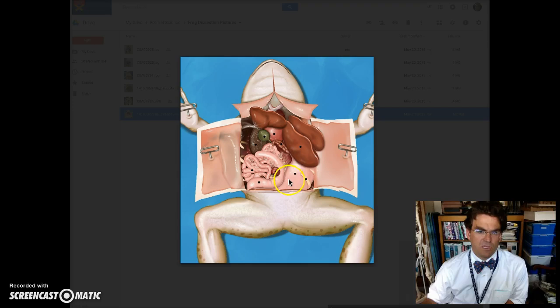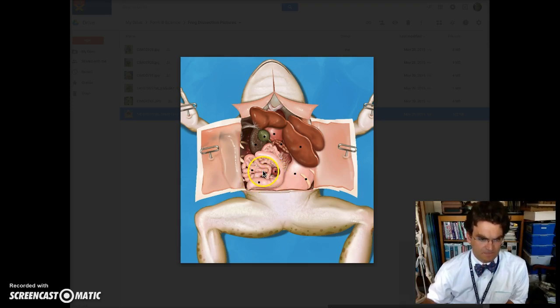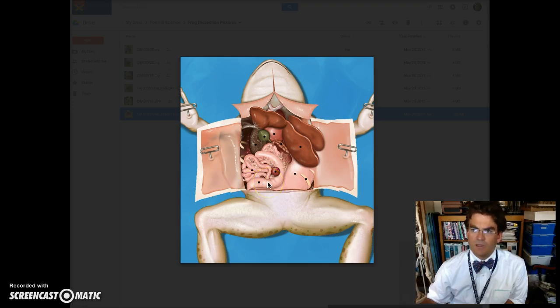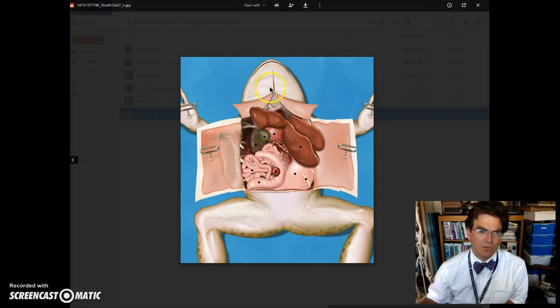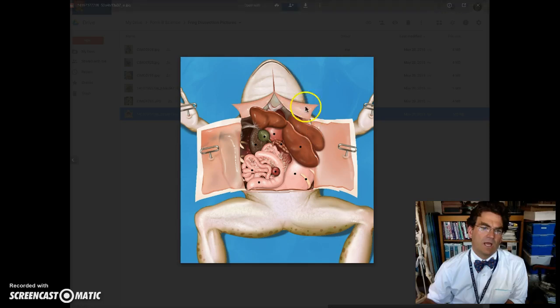The next is the stomach, and the stomach is this big guy right here — that's where the food first goes as it comes out of the esophagus. Then the stomach feeds into the small intestines, and the small intestines really are working themselves all in this area right here — these thinner tubes connected — and then they lead into the large intestines. The large intestines is this kind of big guy right here, and all these curly cues end up feeding into the large intestines. The esophagus is really hard to see in this picture, but if you just label right up here where your esophagus is — this would be your esophagus right here. So we've got the liver with three lobes, the heart, the gallbladder, the stomach, the small intestines, the large intestines, and then the esophagus right here.